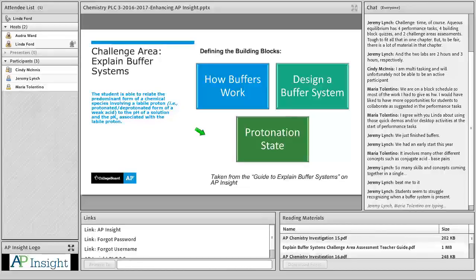And then we analyze all of that data. So every lab team of 2 students must perform a titration and get me a good titration curve. And then we share data around the entire class, this whole body of data, so that we can analyze these various situations and make sense out of them.